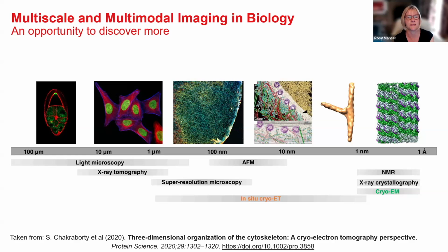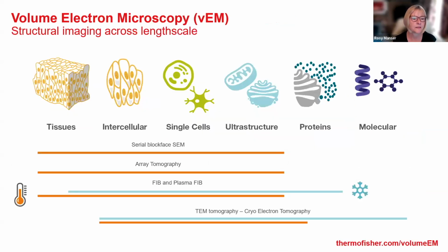There's a lot involved in being able to get that perfect cryo-ET image. And it's been a combination of technology development, expertise, and sample preparation that's really moving this now towards a context of being a standard technique within the whole facility. And it's really wonderful to see that transition taking place.